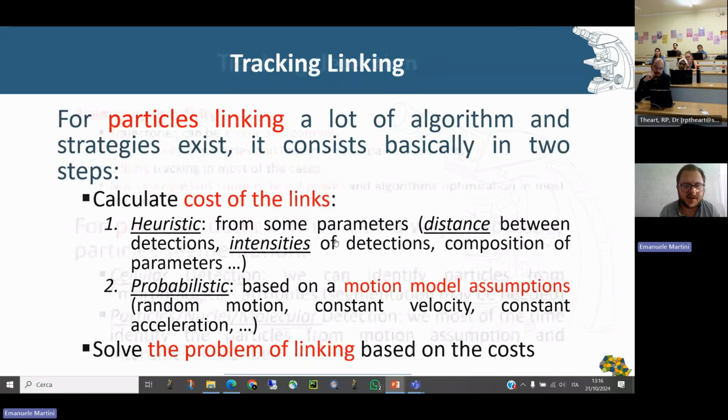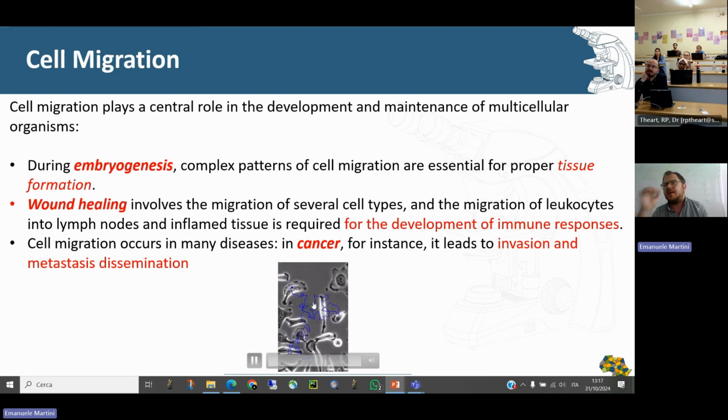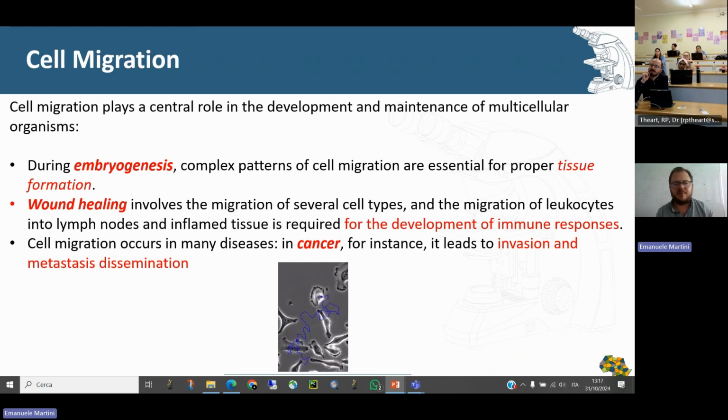But if you have something like the first one I showed you, a case like that, which is just a bright field phase contrast acquisition, so you didn't tag any nucleus, you just have the image of the cell, finding an algorithm able to follow this kind of object, which changes its movement and its morphology a lot, is not so easy. So maybe at the beginning, and for some time, you do it by hand, because it would take longer to find a very good algorithm able to track all of them than to do it by hand for, I don't know, 50 cells for each condition.